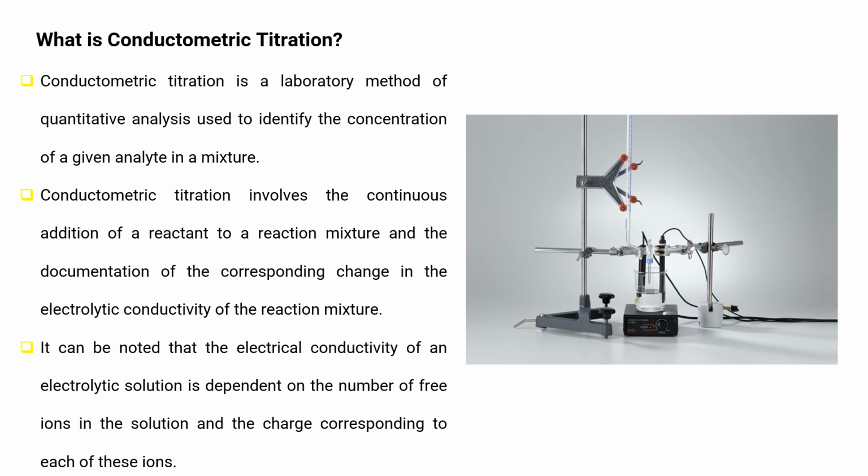So this titration involves the continuous addition of a reactant to a reaction mixture and the documentation of the corresponding change in the electrolytic conductivity of the reaction mixture. It can be noted that the electrical conductivity of an electrolytic solution is dependent on the number of free ions in the solution and the charge corresponding to each of these ions.